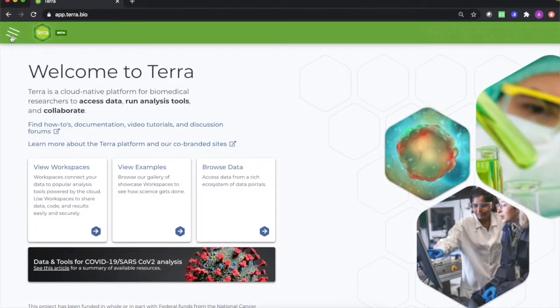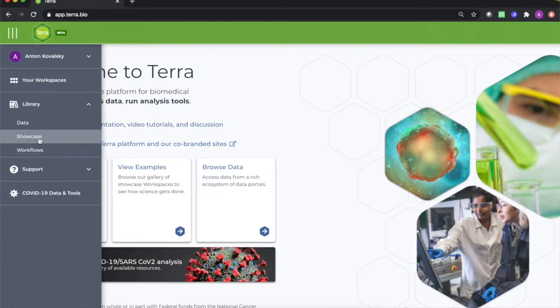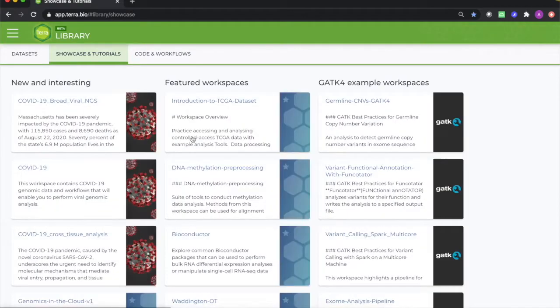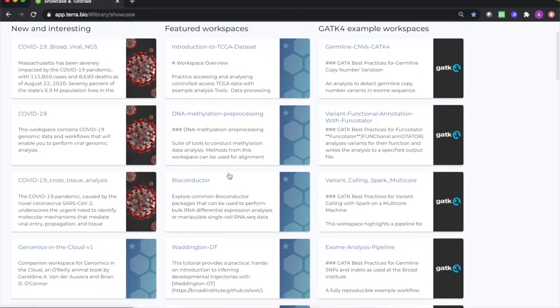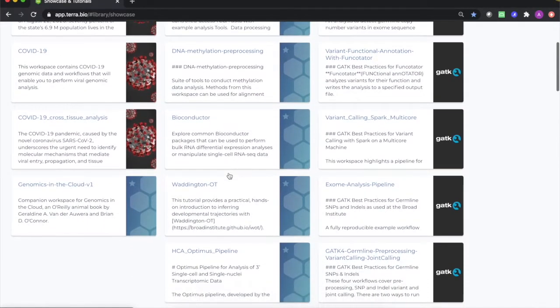Let's start with the simplest way to find ready-to-run workflows. From the menu button, visit the Showcase and Tutorials section of the library. From here, we will be able to clone workspaces that contain preconfigured workflows that we want to use.